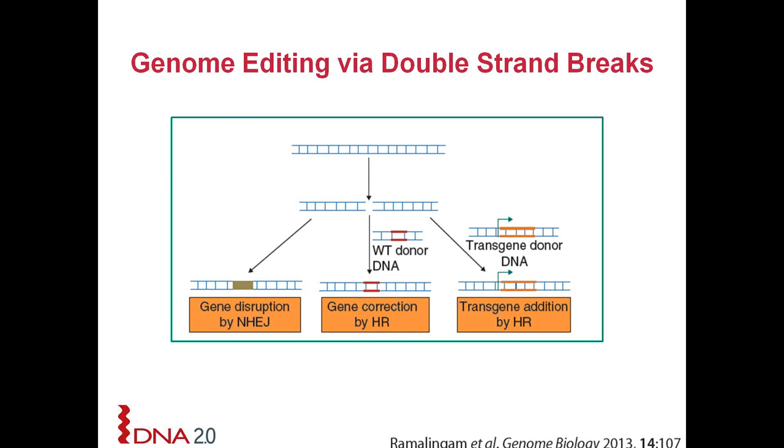Great, thanks. The next question is, what is the maximum size of insertion for new DNA sequences? That is a good question. It'll depend on your host of interest. It shouldn't be any different from what it is without using CRISPR generally. CRISPR only helps enhance the efficiency, so you have to screen for your clone, then you can do it without markers. But I don't know if it will make a difference to how big you can go. It might a little, because now you can screen for even rarer events than you could before. But it will just depend on the organism of interest and what's been reported about homologous recombination in that system.